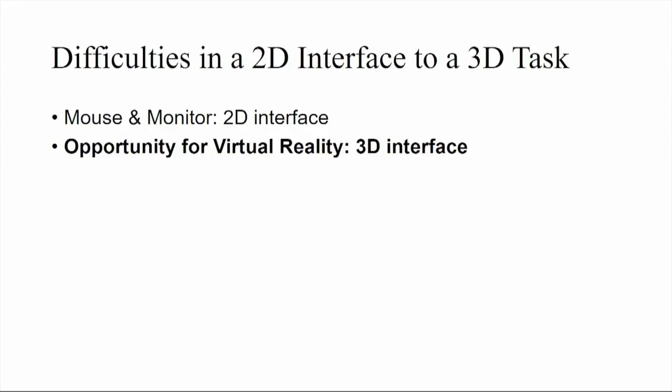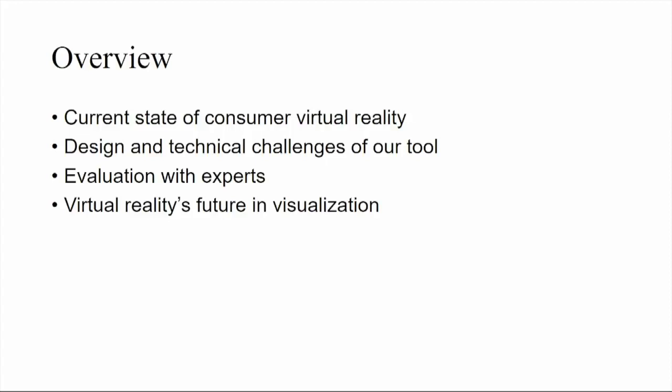We see this as an opportunity for virtual reality, where using recent hardware, we're able to provide a fully immersive 3D interface that you can work in. I'll start with an overview of the current state of consumer virtual reality, talk about the design and technical challenges specific to our tool, look at our evaluation with experts, and then think a bit about virtual reality's future in visualization in general.